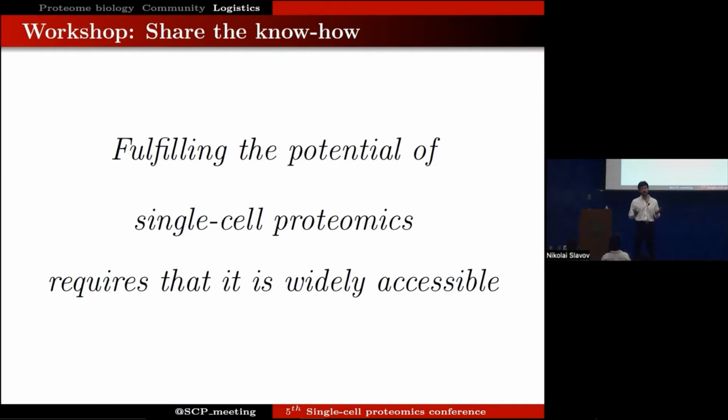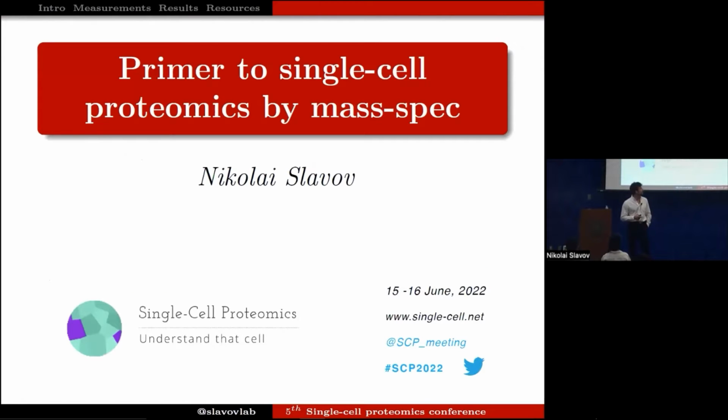I'm going to start with the very first workshop presentation, with the aspiration of explaining single-cell mass spectrometry analysis in a very accessible way, I hope, particularly from the perspective of somebody who is very experienced with single-cell RNA sequencing, with other forms of single-cell analysis, but perhaps not with single-cell mass spectrometry. The idea is to provide the 10,000 feet overview and the framework within which you can put in context all of the exciting discoveries and method developments that you're going to hear about from colleagues presenting throughout the rest of the meeting.